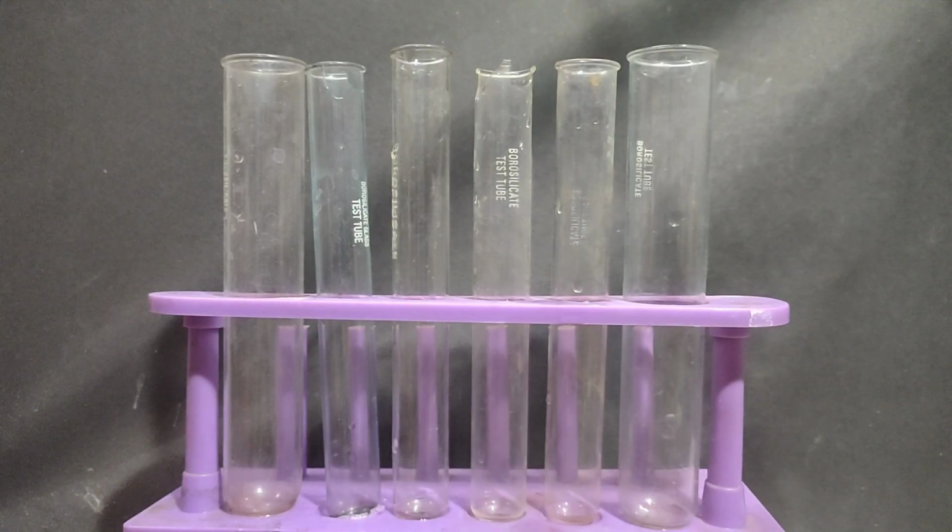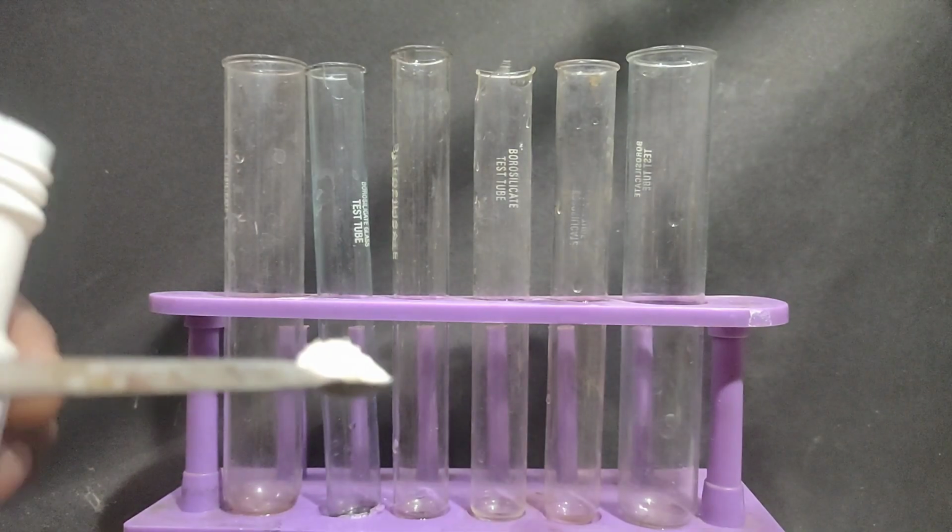Video, I'll be showing the test for lead ions. As you know, lead is in group 1, so first I'll be showing you the test for group 1 and then I will be proceeding with the test for lead ions. So this is my salt, this is lead nitrate.